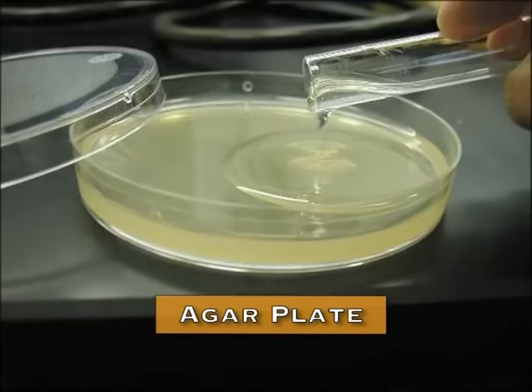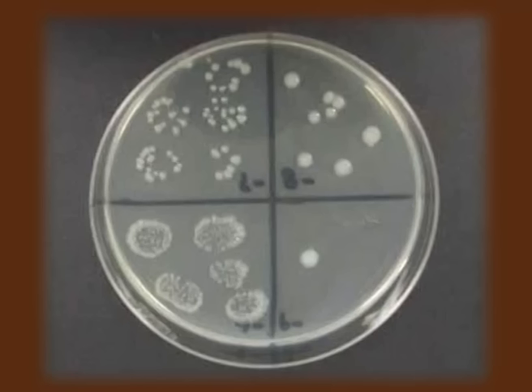When the sterilized culture medium containing agar is spread into a Petri plate, it covers a large surface area and it is known as agar plate. Agar plate is generally used for the isolation of pure culture from a mixed group of bacterial culture. So this was on the basis of consistency.